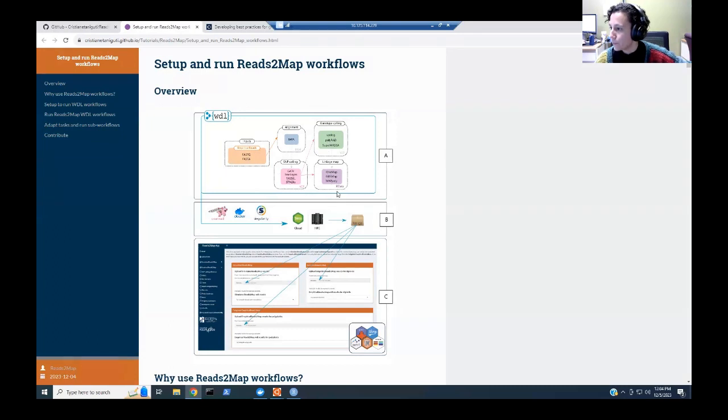Okay. And so I split the workflows in two parts. One I call the SNP calling, that would be these first two circles here, and the mapping part. That's the read dosage calling, the genotype calling, and the mapping.